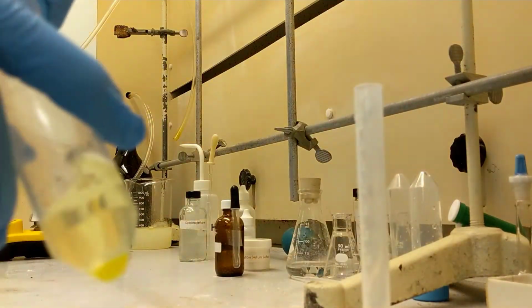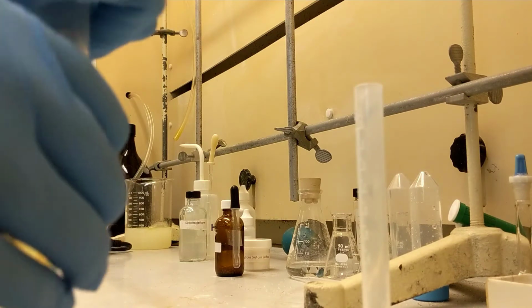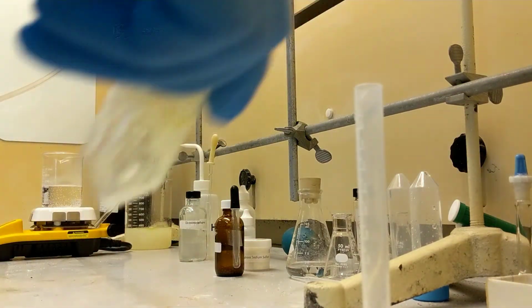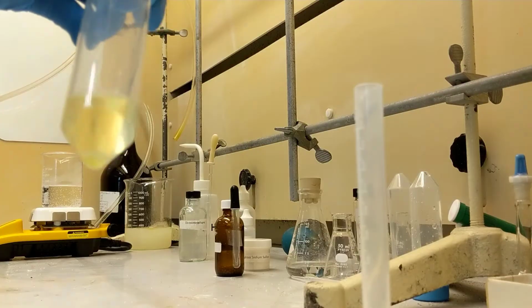You can see it there. Just going to screw this on and shake it. Going to dissolve it all the way. Get back to you guys when I'm done.